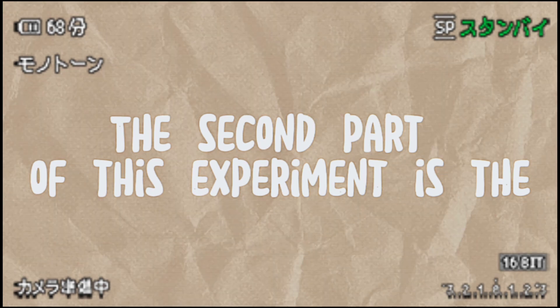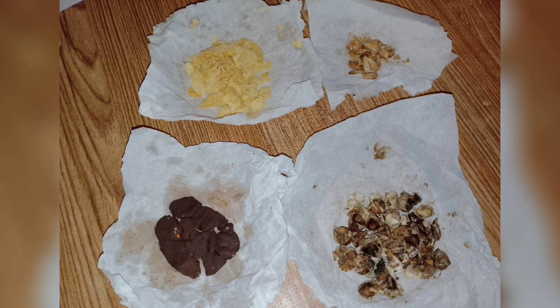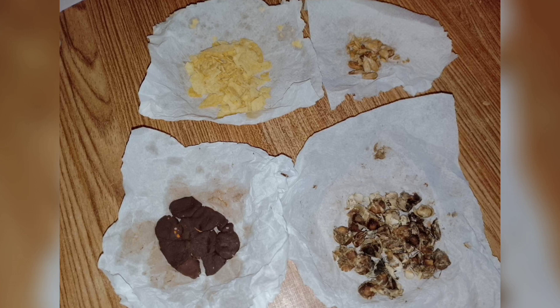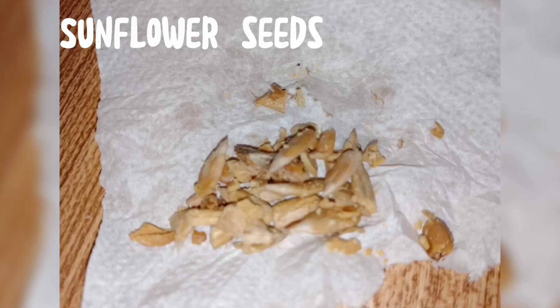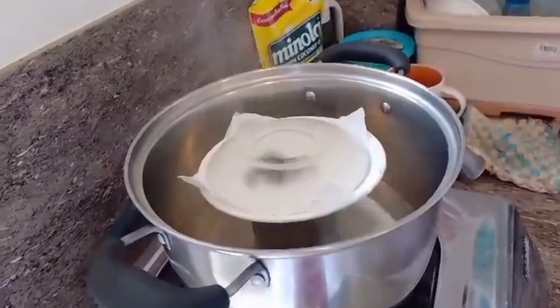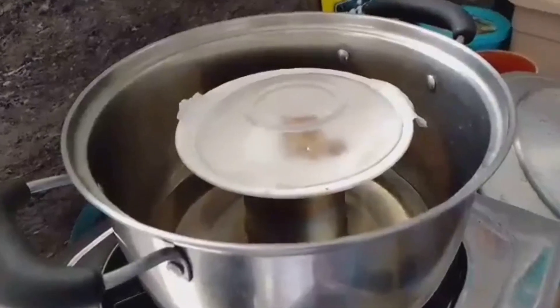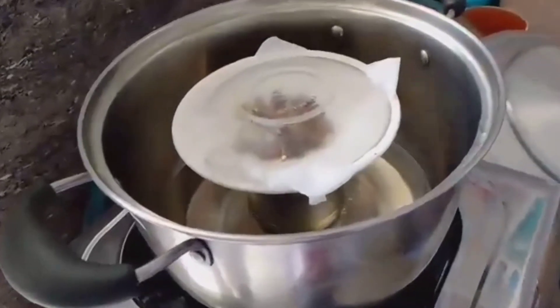The second part of this experiment is the visible evidence of invisible fats from foods. Here, we measure out 2 grams of each sample such as chocolate and potato chips, and sunflower and malunggay seeds. Then we place them individually on a paper towel in an evaporating dish, cover with a watch glass, and heat through the water bath for 60 seconds on high.